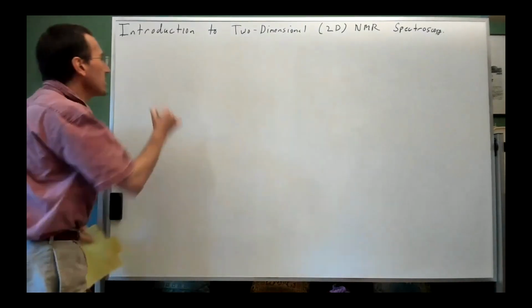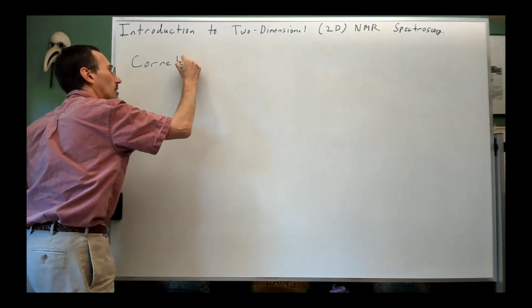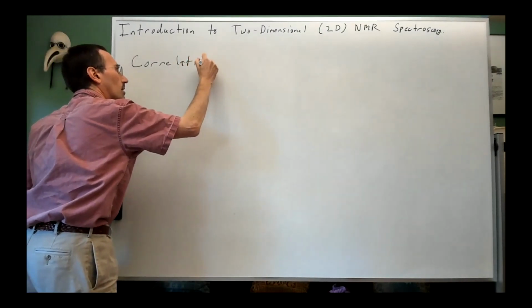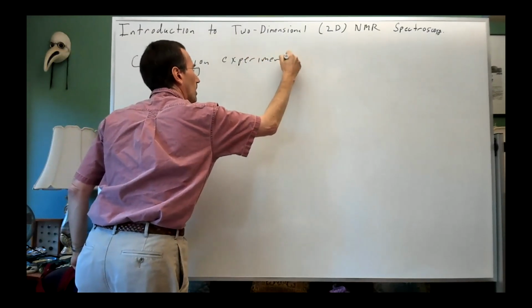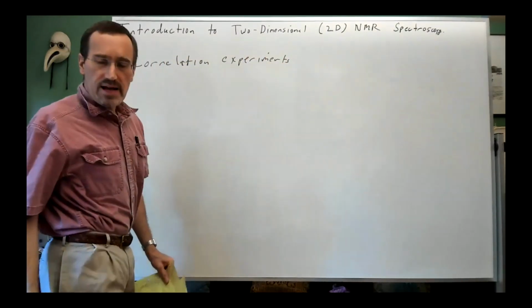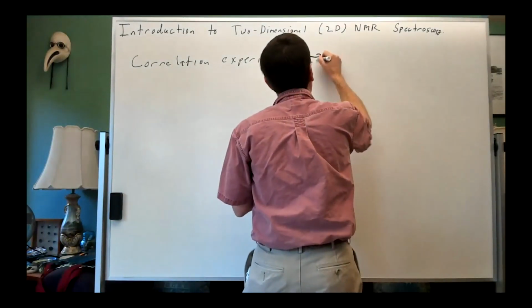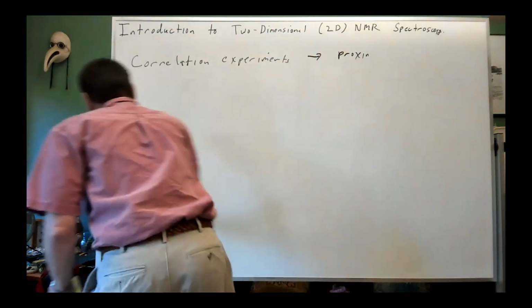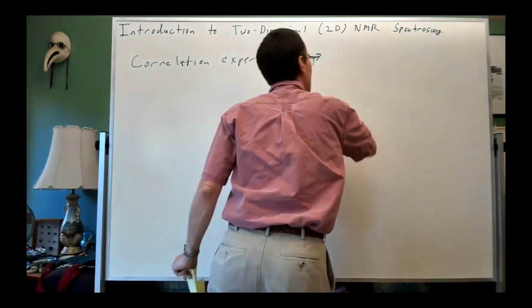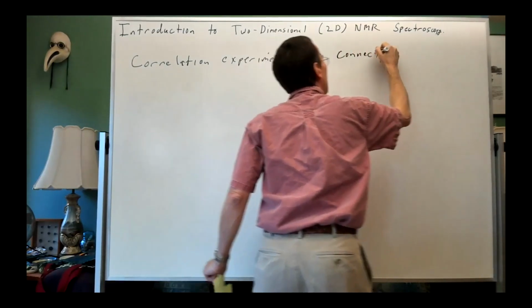There are correlation experiments, and these give rise to information on connectivity. My mouth is moving ahead of my writing.